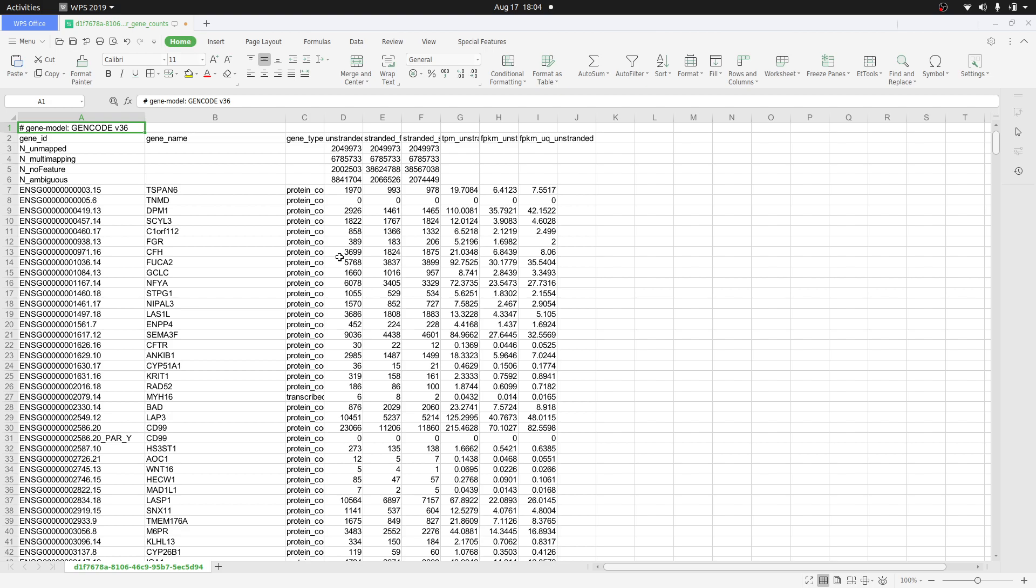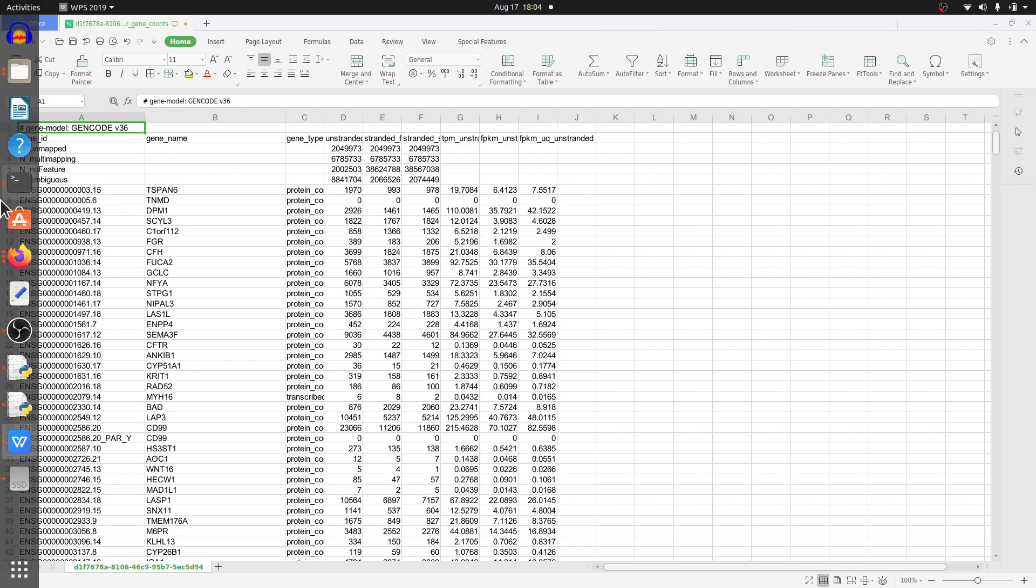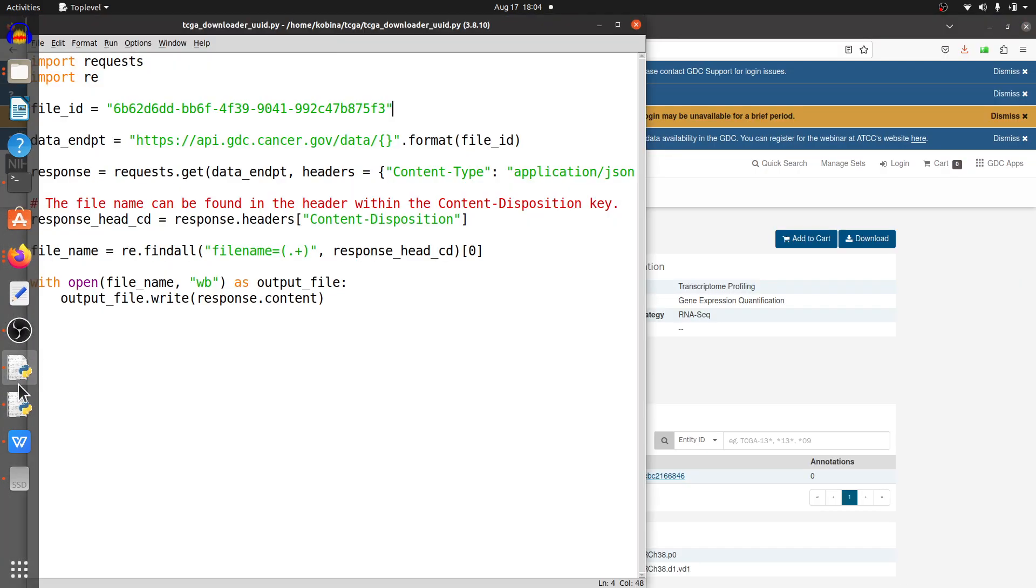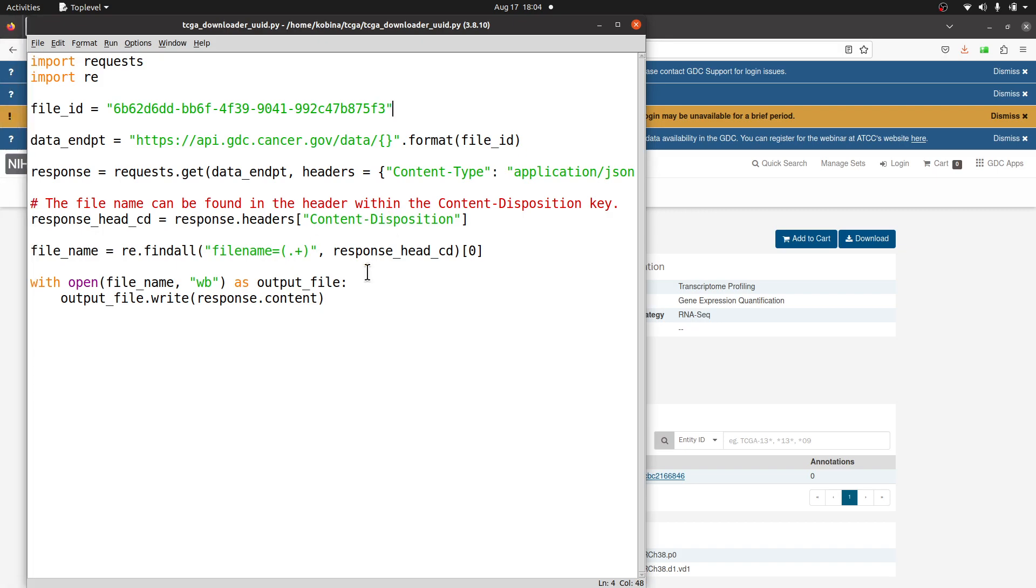Here what we did was to download just a single file for one sample. Let's go back to the script.